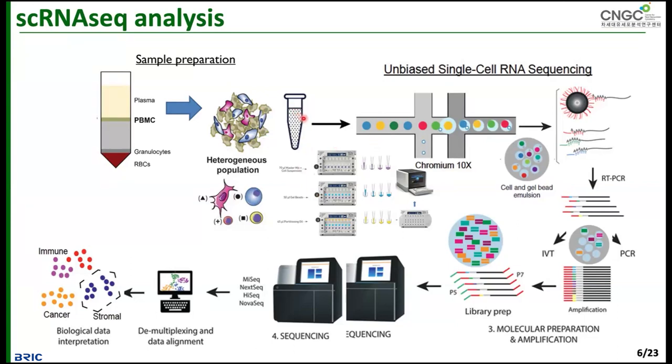and also the kit is very expensive, and you cannot go for a second or third trial because it is very expensive. So you need to prepare properly before starting the experiment. Once you start the experiment, you need to finish it well to get this kind of result. That is part one.